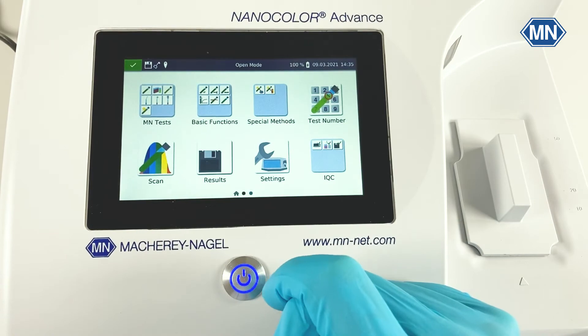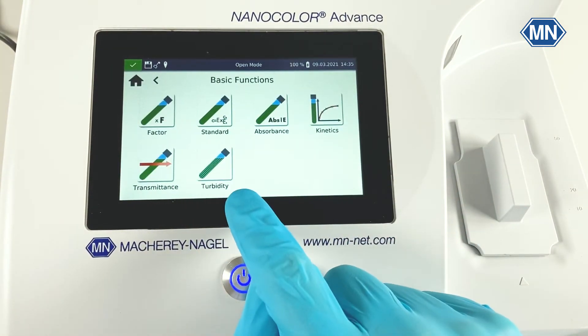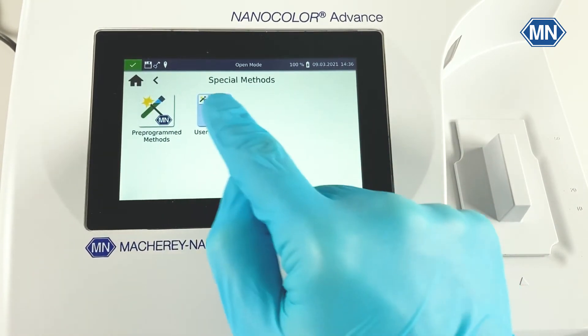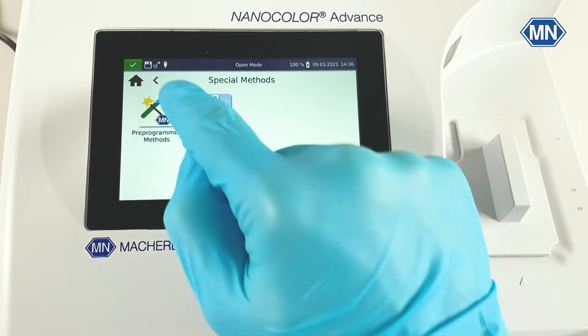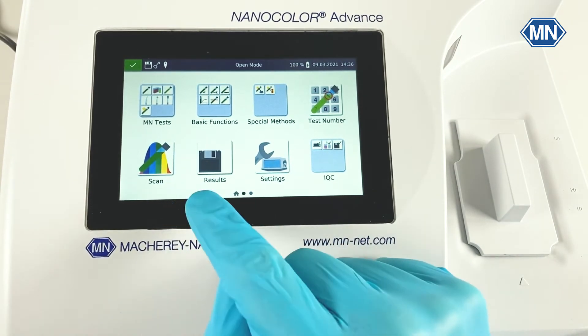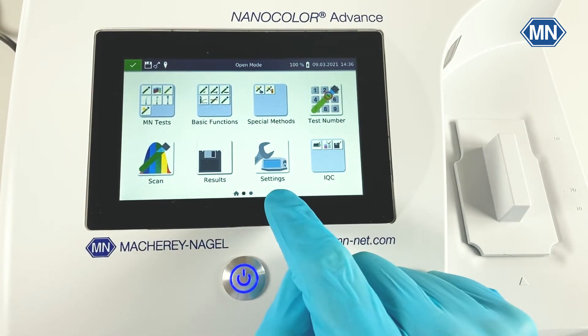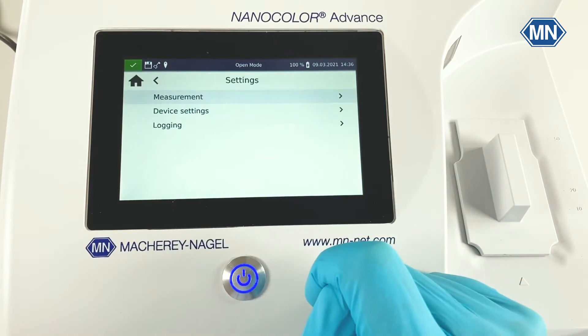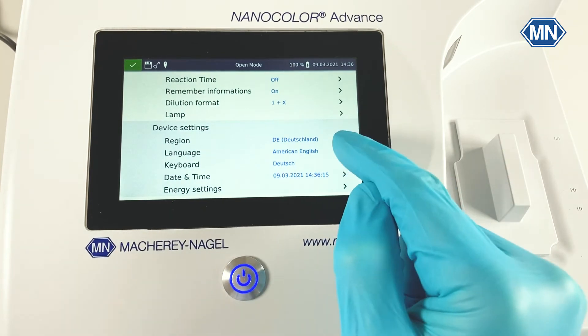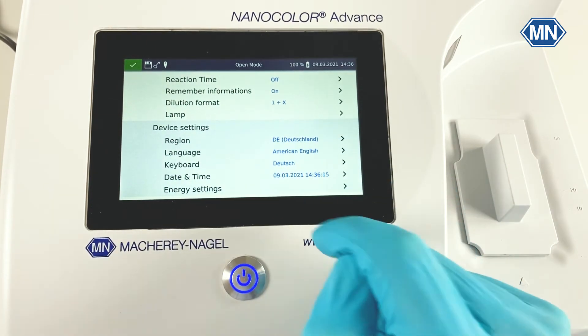The second screen also contains basic functions like the measurement of 2BDT as well as special methods. Here, you can implement and validate user methods yourself. It also contains the full scan, the measurement results, as well as the settings menu. From here, you can change the measurement settings as well as the device settings like the region, language, and date and time.